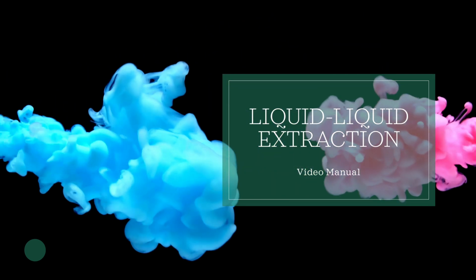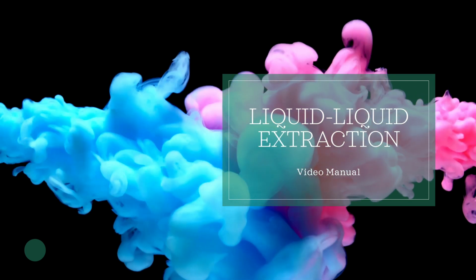This is the video manual for liquid-liquid extraction for Group E.